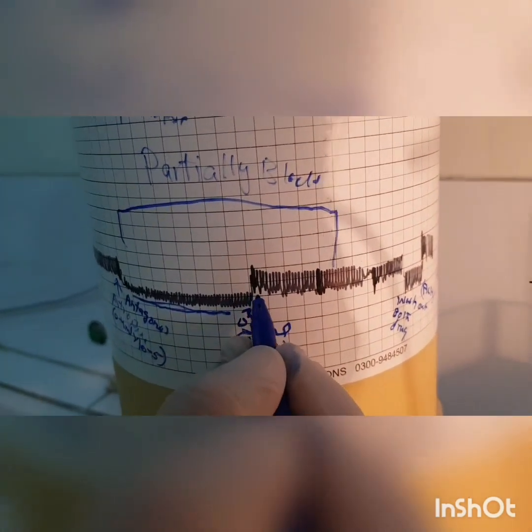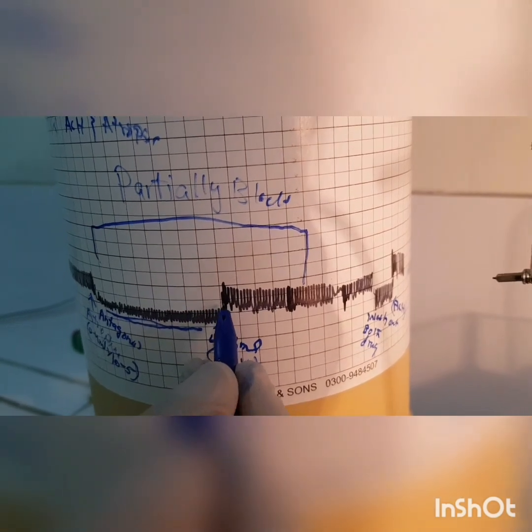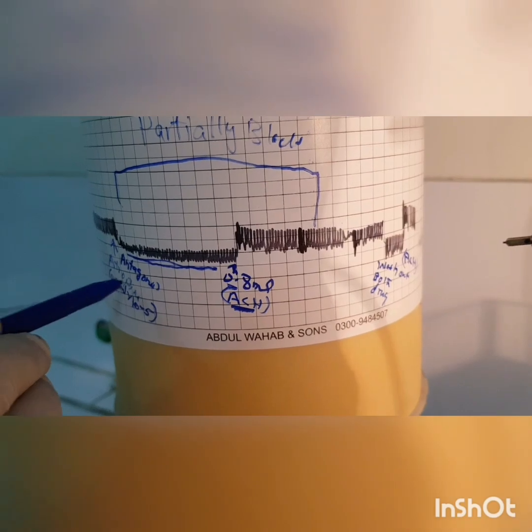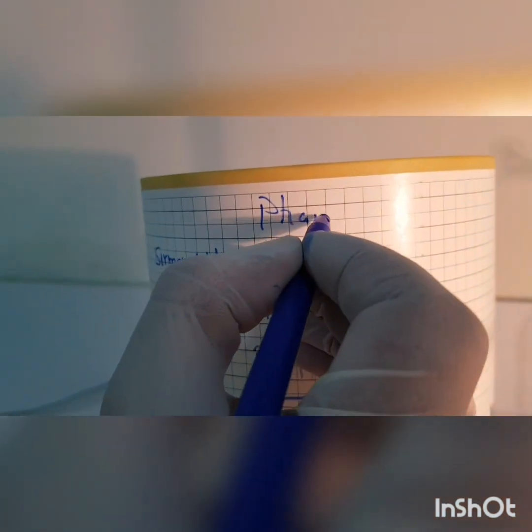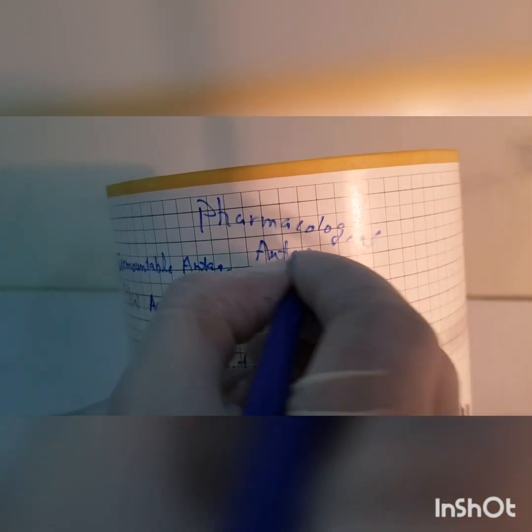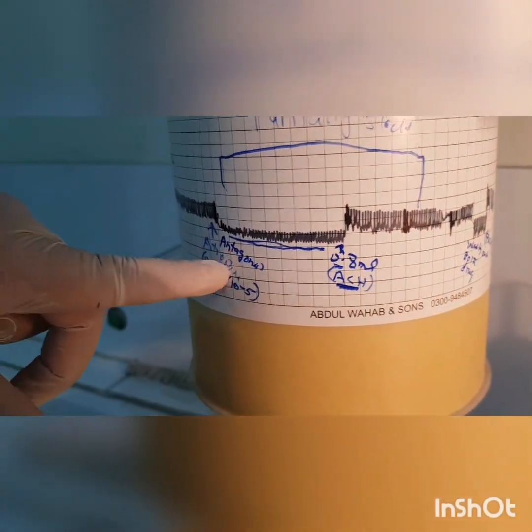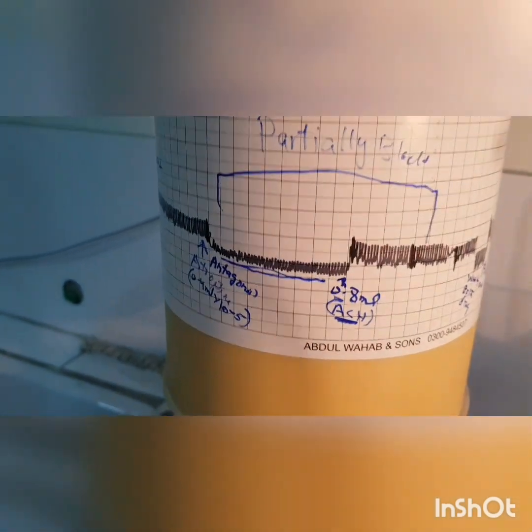And this type of antagonism between acetylcholine and atropine, which compete for the same receptor, is called competitive pharmacological antagonism. Because the antagonist blocks the muscarinic receptor and the agonist stimulates the receptor.